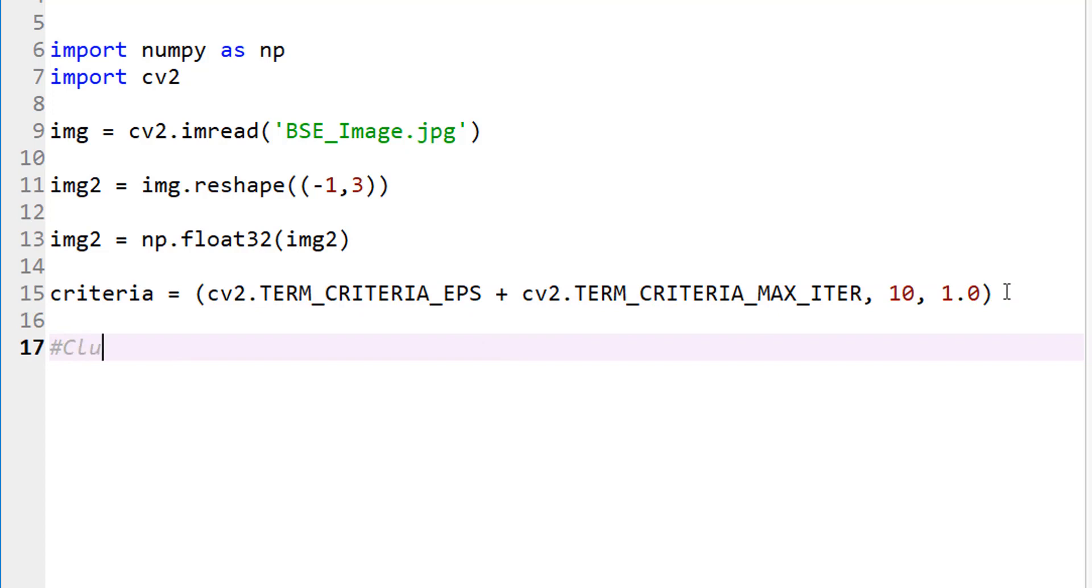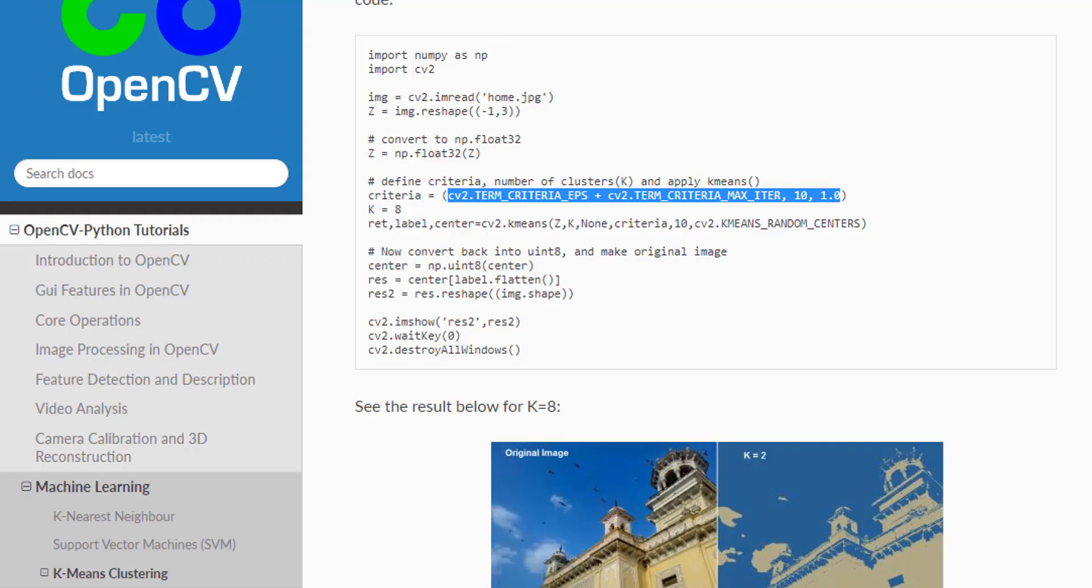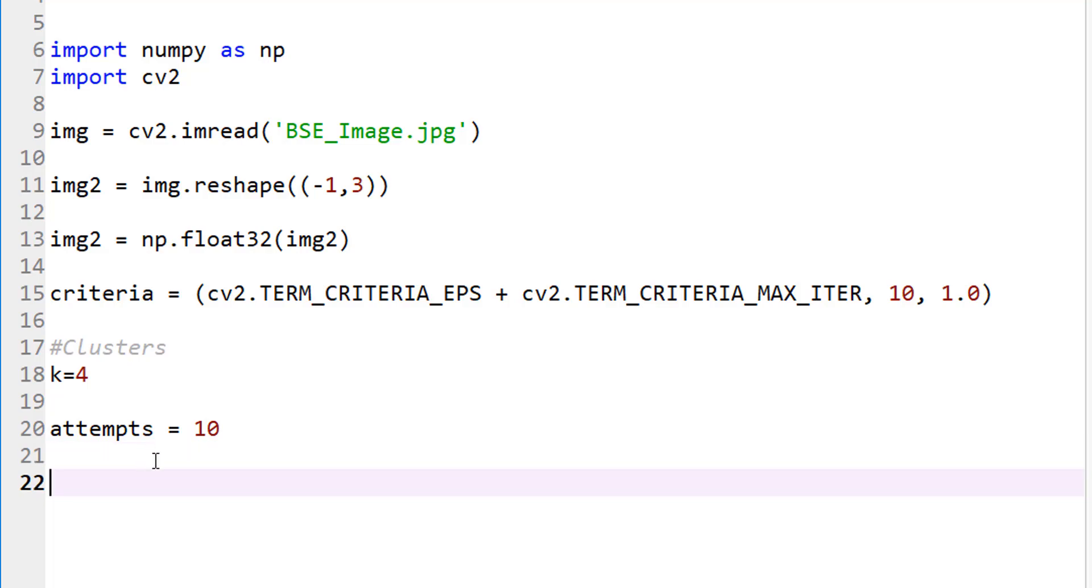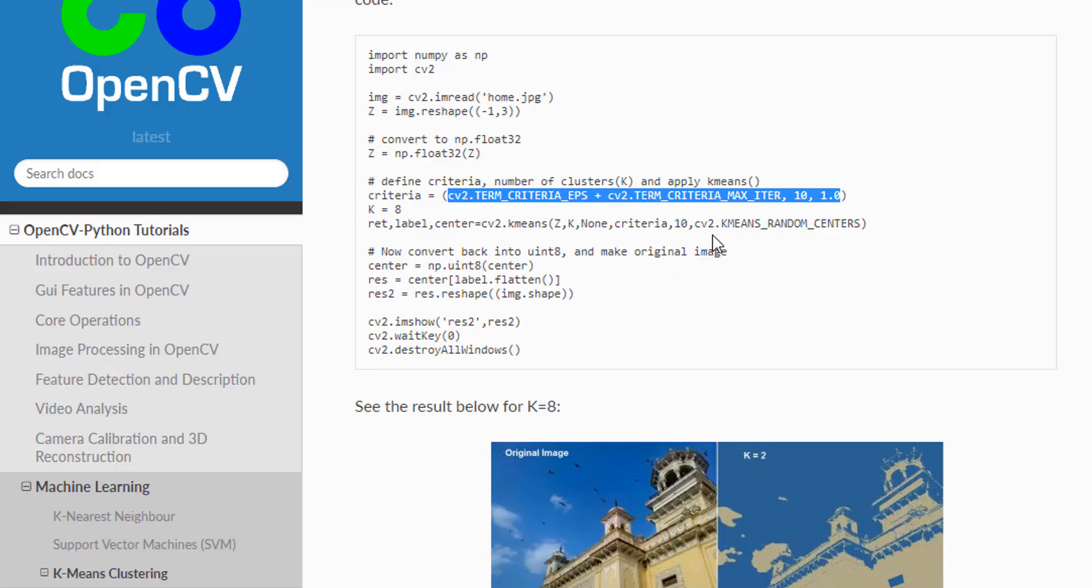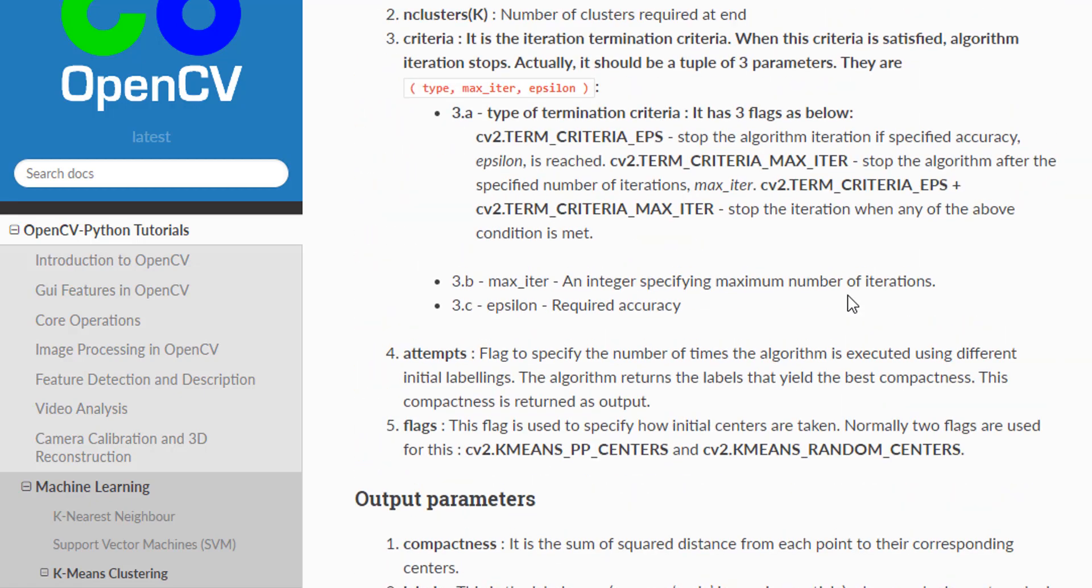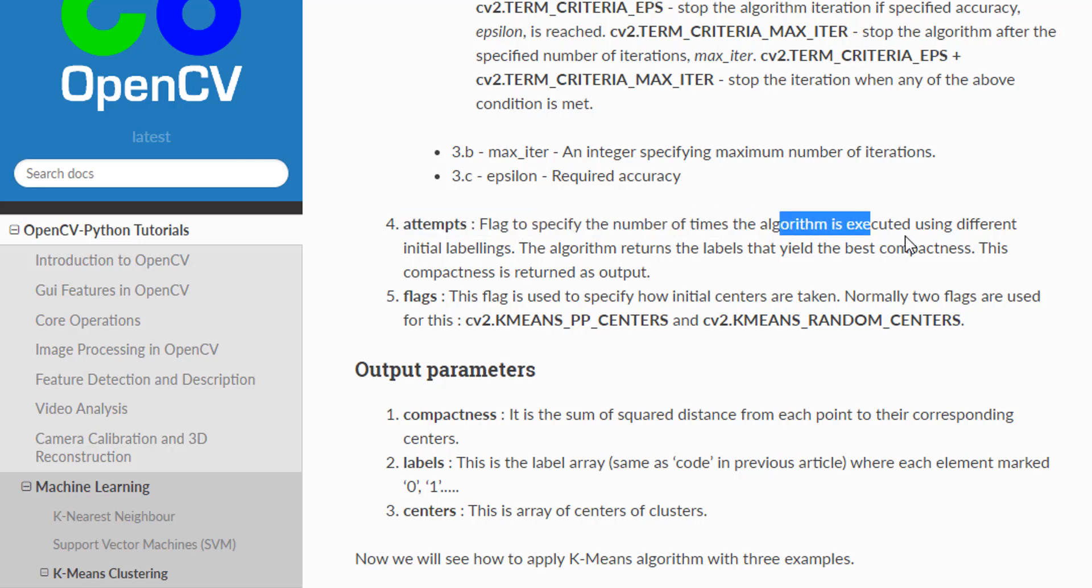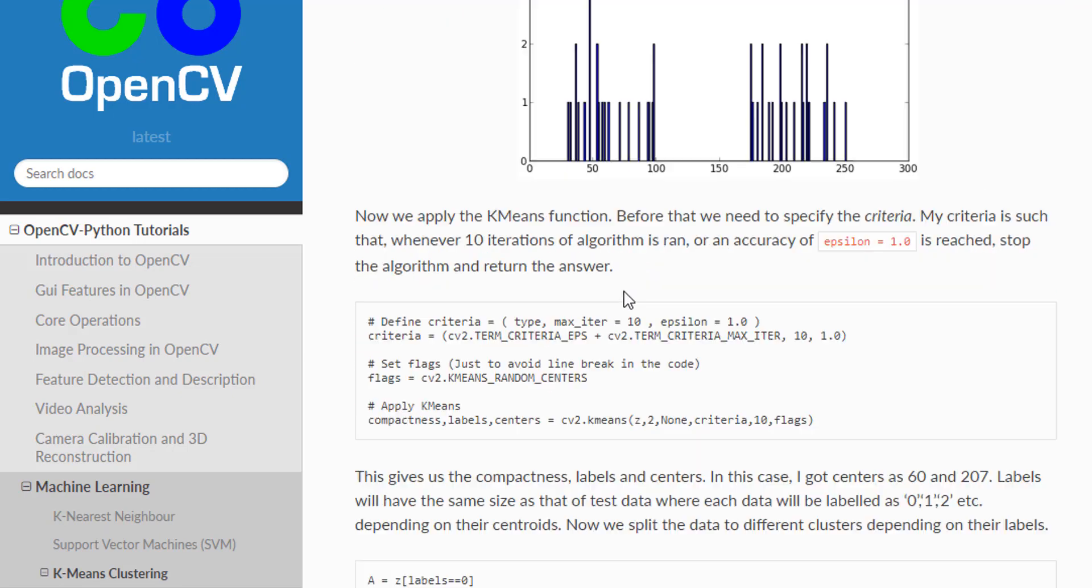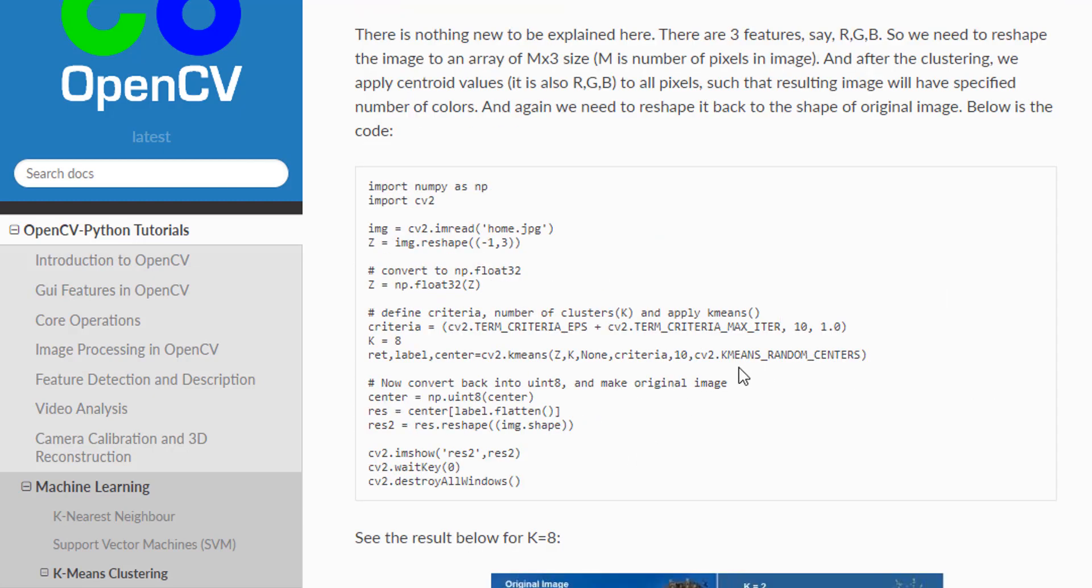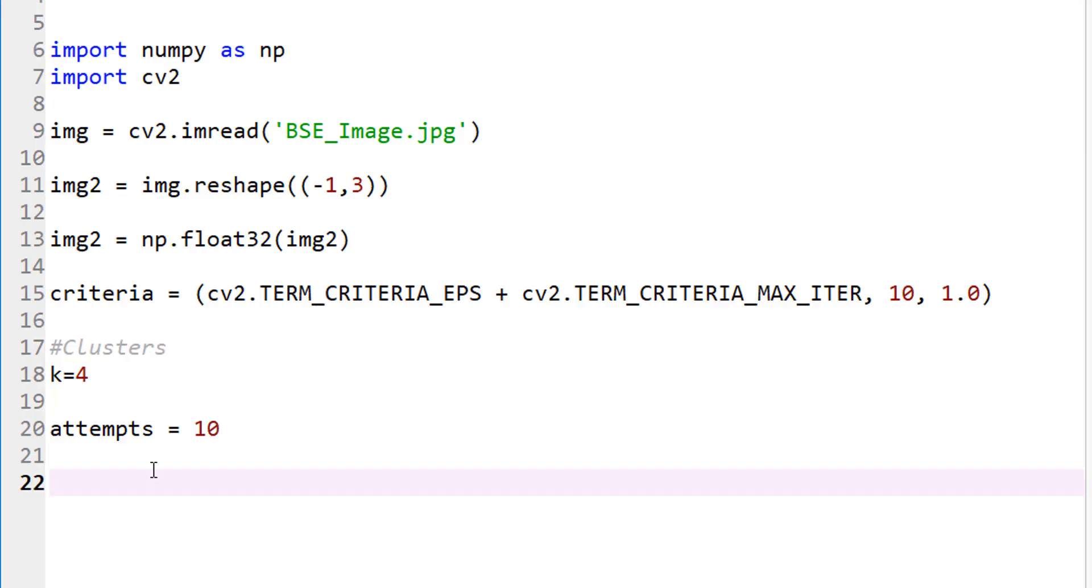I believe that's also one of the inputs we need to give. Let me go back here. If you look at the documentation, it talks about what attempts is. It's a flag to specify the number of times the algorithm is executed using different initial labelings. The algorithm returns the labels. I'm going to use that as part of my input. I'm going to copy this so I can edit it right here.